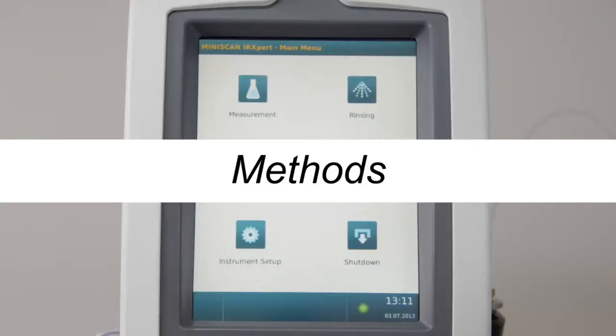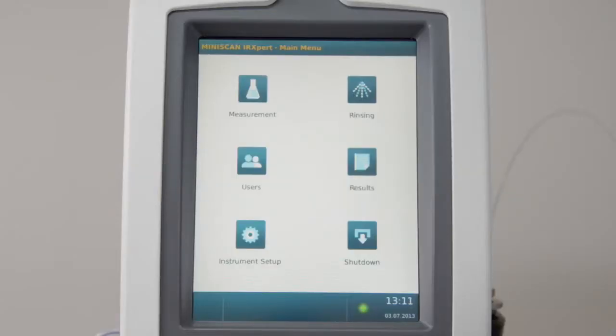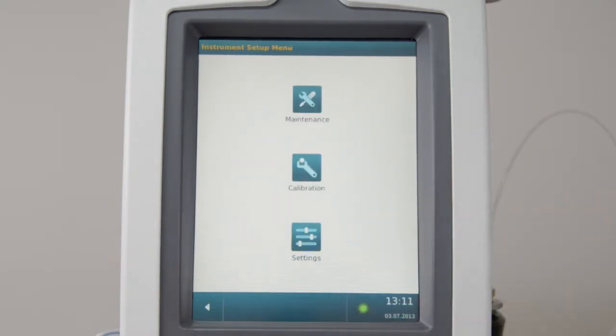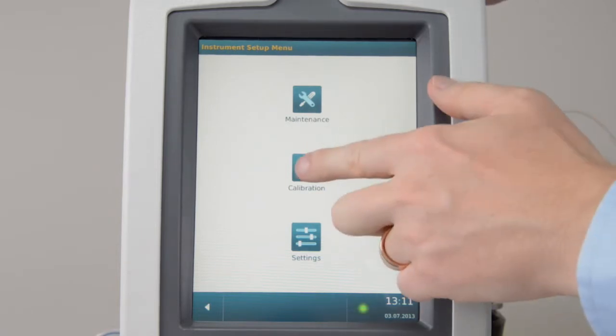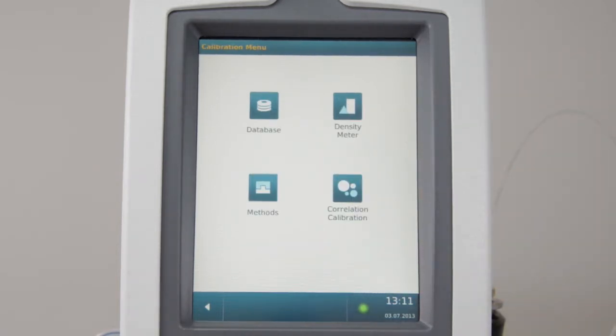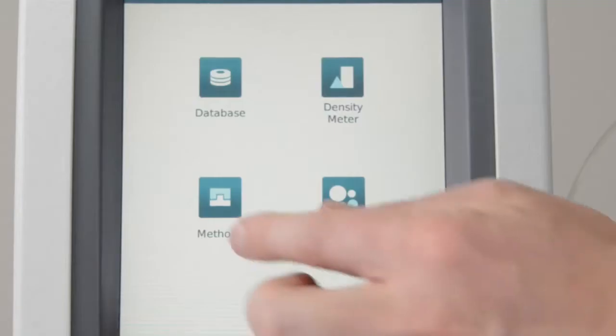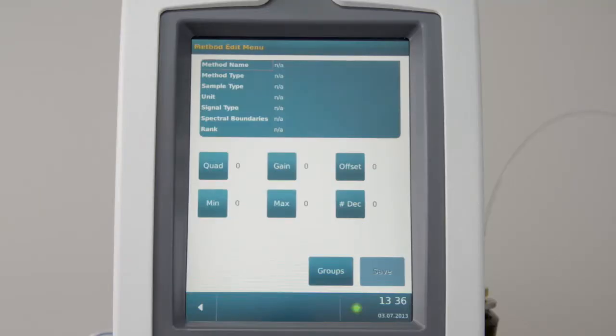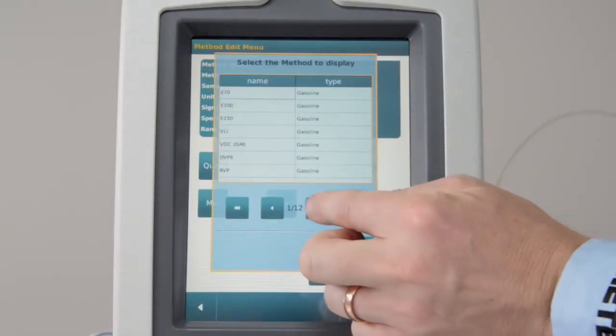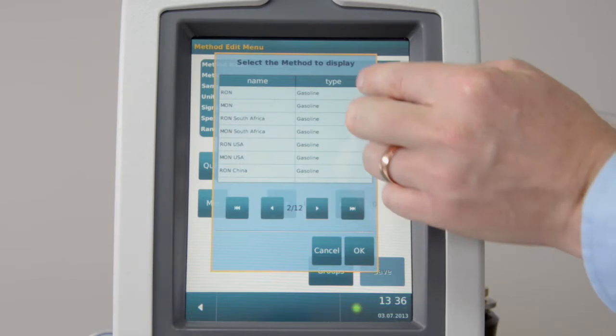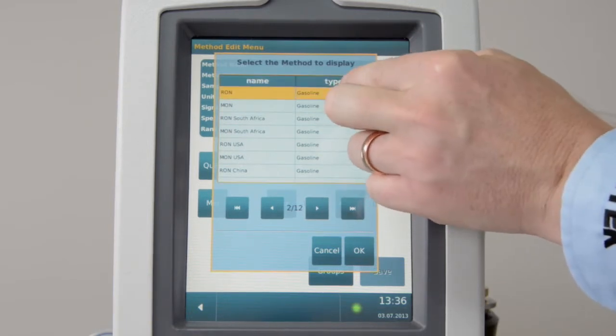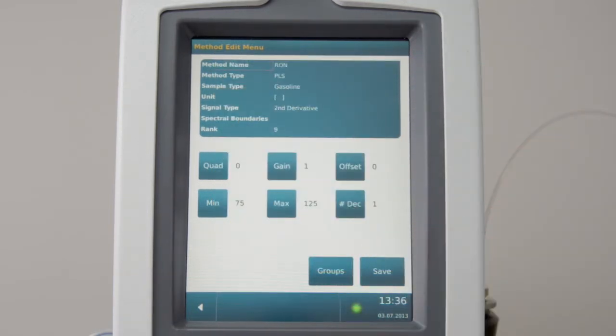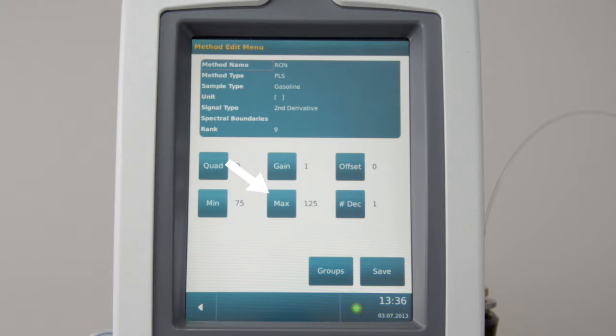Methods. To review the methods used for measurement and prediction, go to Setup. Enter Calibration. Click on Methods and select the method you want to review. All information about the specific method is listed here. You can change the minimum and maximum limit for this method. You can change the number of decimals that shall be shown in the result.